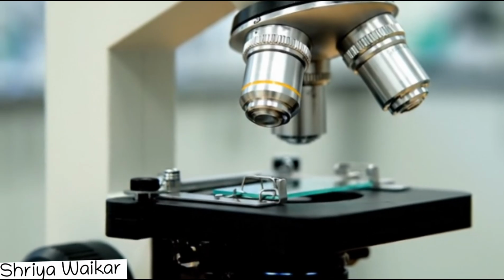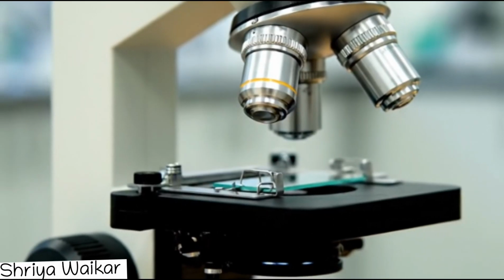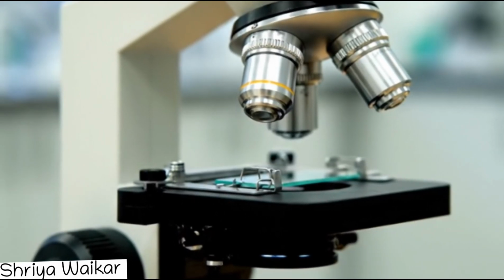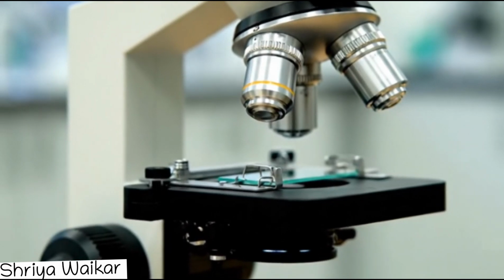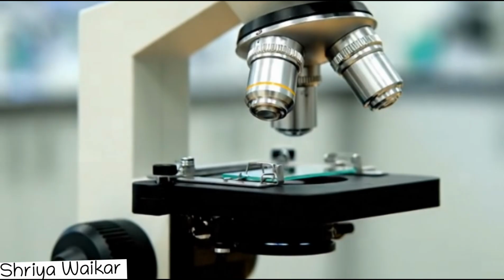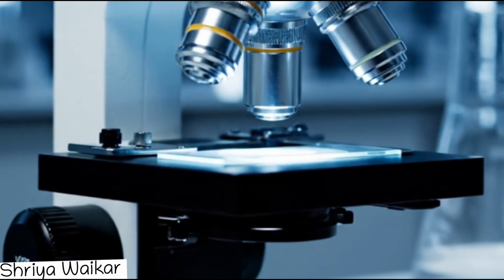And how can we visualize? First we prepare a slide of a plant tissue or of a microorganism like a virus, fungi, etc. Then we place that slide on the stage, and through the objective we can observe by keeping our eye on the eyepiece. There we can observe and magnify the images as we want according to our eye adjustment, and we can visualize things very easily. Using the powerful electron microscope technique, even DNA molecules or bacteria and viruses have been visualized.